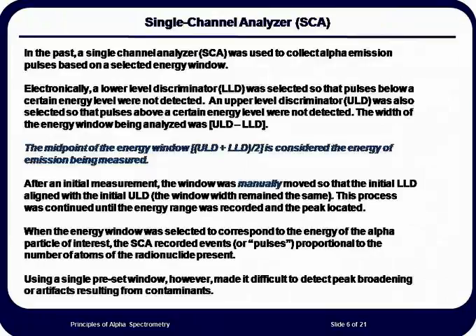The electronics of the instruments were configured so that only a response within the energy range measured was recorded, and not energies that were higher or lower. This configuration of counting was known as a single channel analyzer, or SCA.